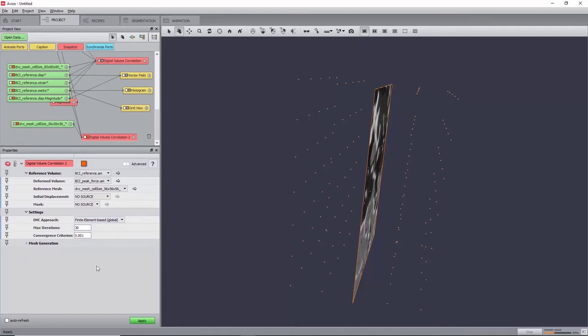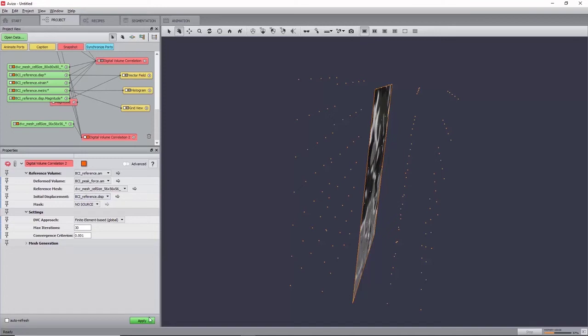Finally, in the optional connection section, set the initial displacement port to the displacement field resulting from the previous local computation. Now click Apply.